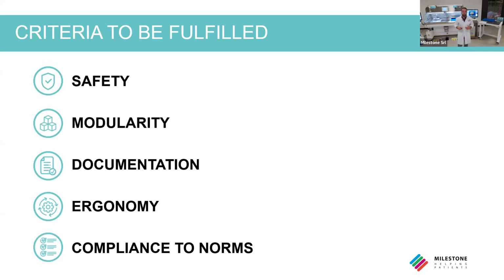Then documentation is extremely important, because of course it is proof of evidence, and it also allows you to print a report, and it is also extremely important for the diagnosis for the patient. Then a nice-to-have is, of course, the ergonomy. So people that work at the grossing station must be at ease using it. They must feel confident using them. And then, last but not least, there is compliance to several norms regarding the construction, the retainment, and also the ergonomy. But later we will discuss all of them.